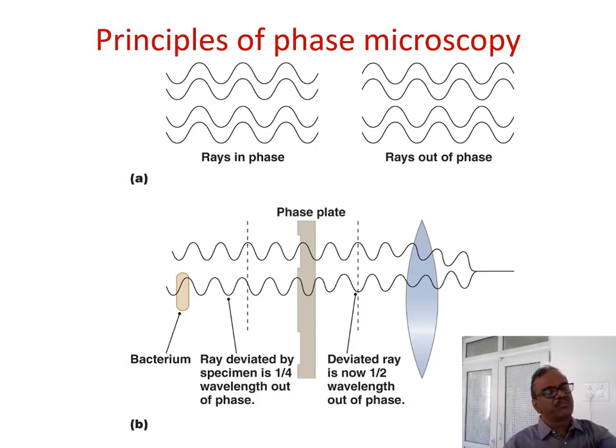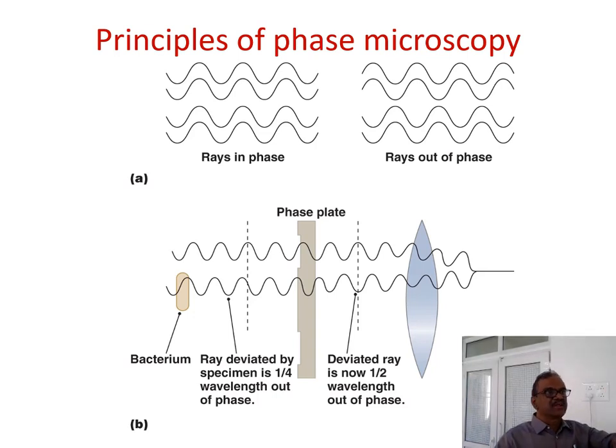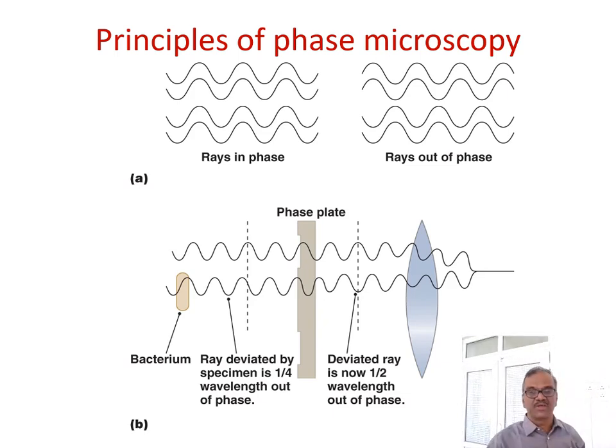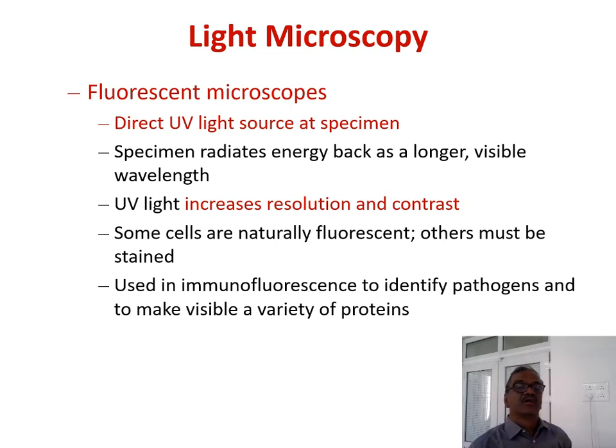Okay, and then depending upon this you can make different contrast, different thicknesses. You can see a cell wall or epidermal layer, you can also see the vascular bundle, or if you are taking a cell you can see a plasma membrane, at the same time you can see a nucleus under different contrast. Okay, so this is the basis for contrast, phase contrast microscope. Then fluorescent microscope. Okay, so by the name itself it is self-explanatory.